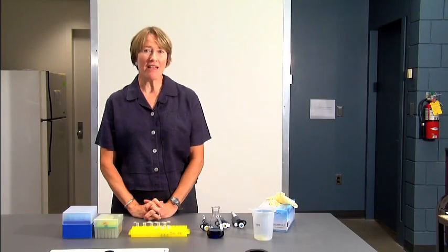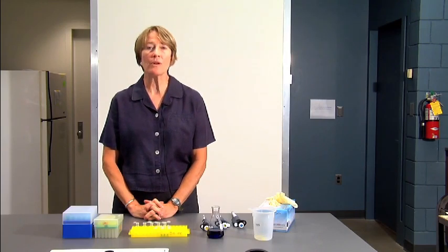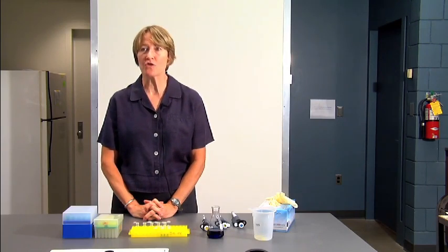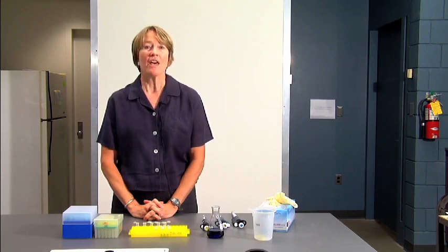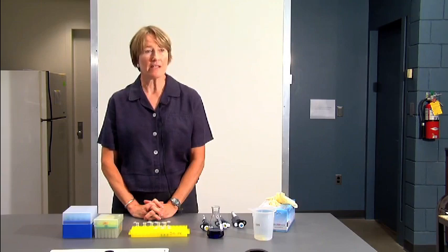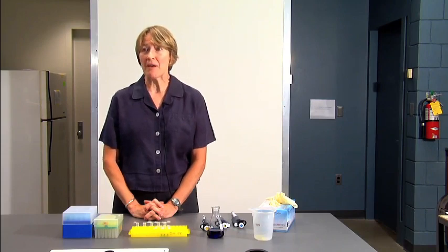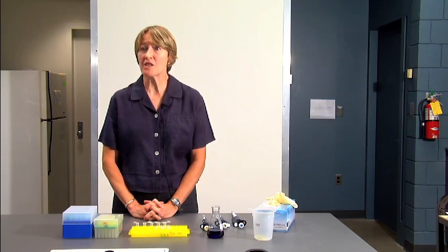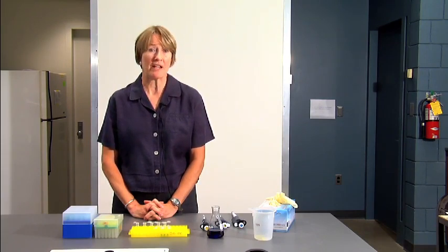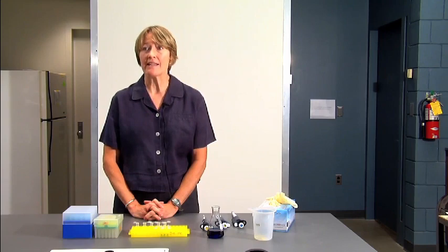This week in the biology lab, you're going to be using micropipettes. Micropipettes are equipment that biologists often use for doing biochemical reactions. They're used for measuring very small volumes of liquid, things like nucleic acids, which we're going to use in lab. We're going to be isolating DNA, or you could be pipetting radioactive substances or bacteriological substances, bacteria or viruses. So it's very important to learn how to use them accurately and safely.